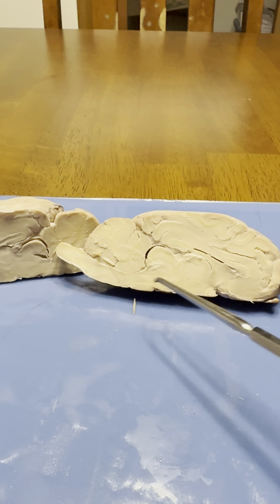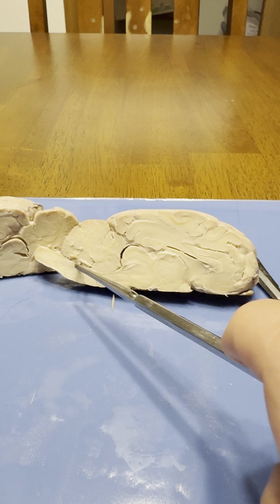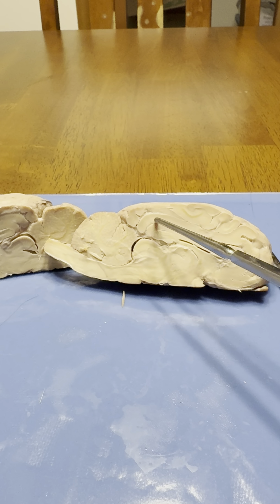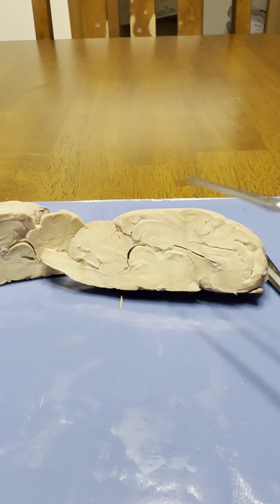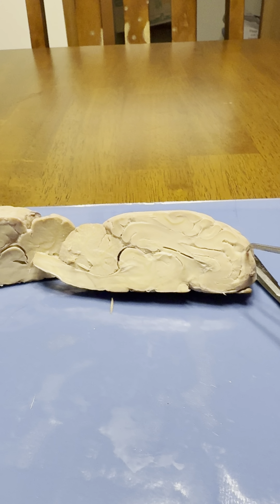And then you have the fourth ventricle right here, and that is a fluid-filled cavity. And then you have the cerebrum right here, and it's two hemispheres. And then on top right here is the cortex, and it's the outer portion of the cerebrum.